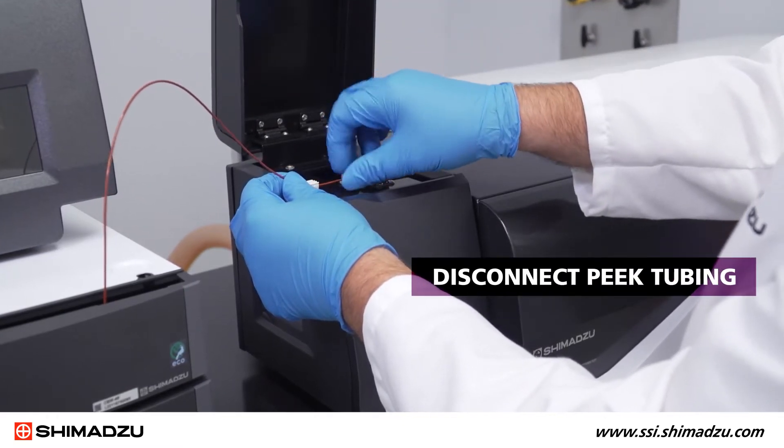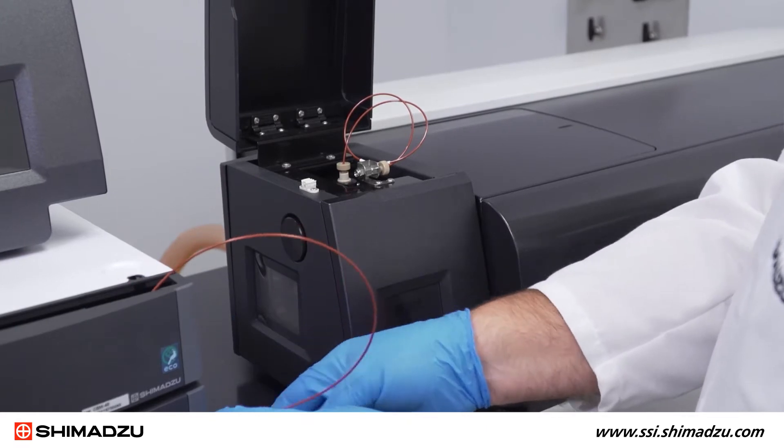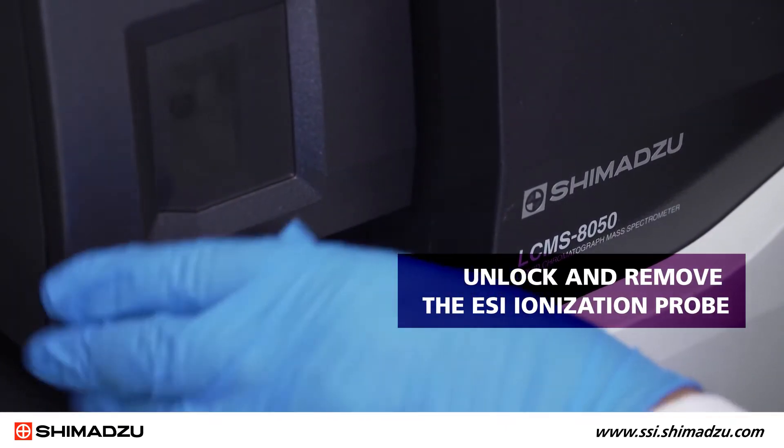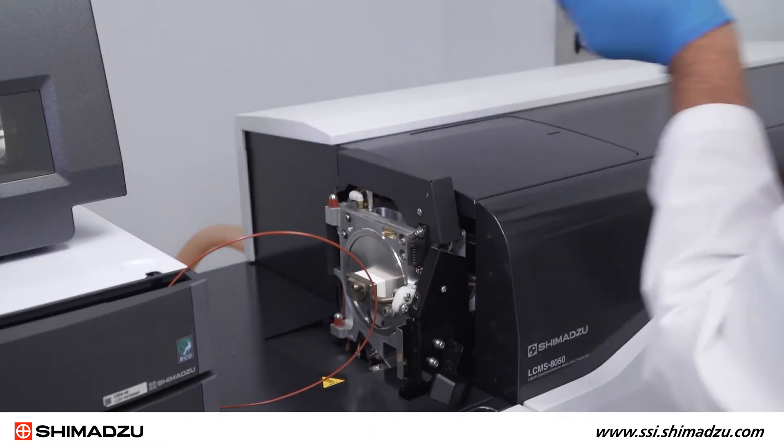Open the lid and disconnect the peak tubing coming from the LC unit. Next, unlock and remove the ESI ionization probe by carefully lifting it off the hinges.